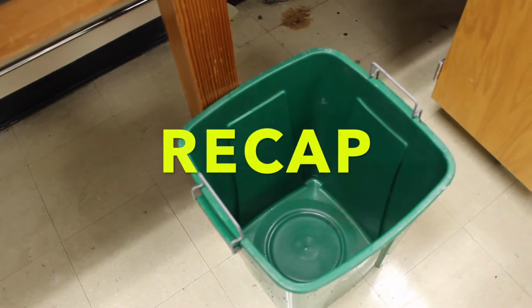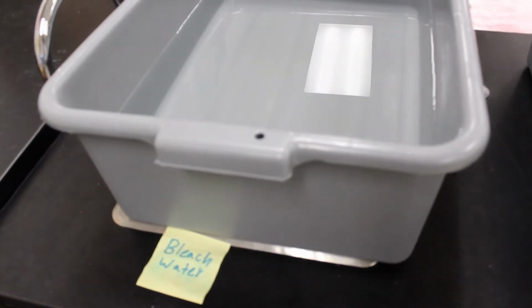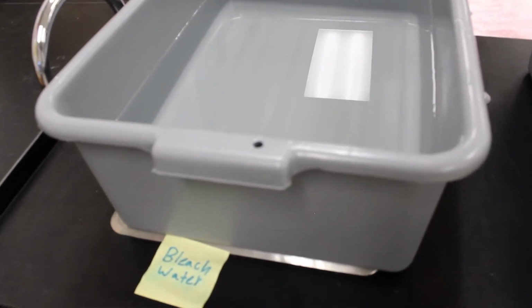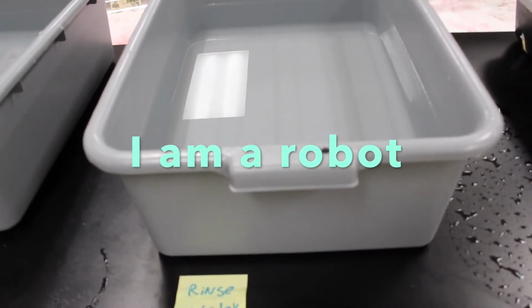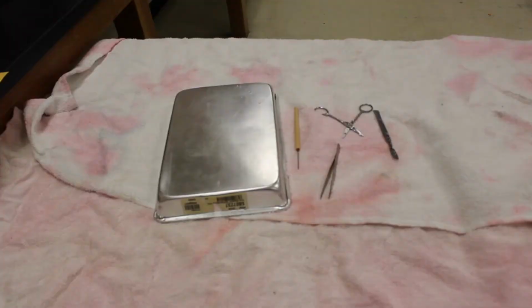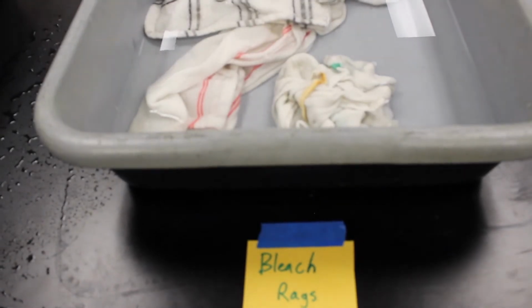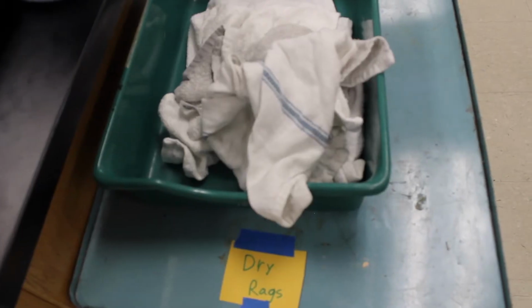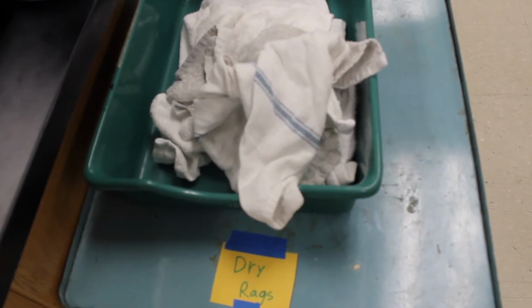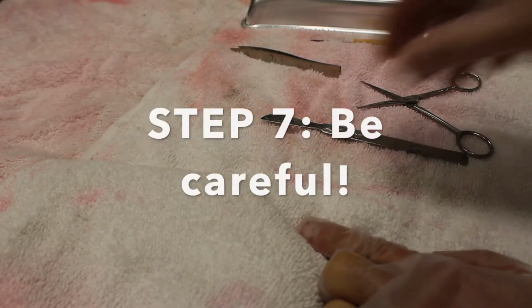Step 1, put Biowaste in here. Step 2, rinse everything in bleach water. Step 3, rinse everything in regular water. Step 4, put things out to dry. Step 5, wipe down with bleach rags. Step 6, dry off your tables. Step 7, don't do this.